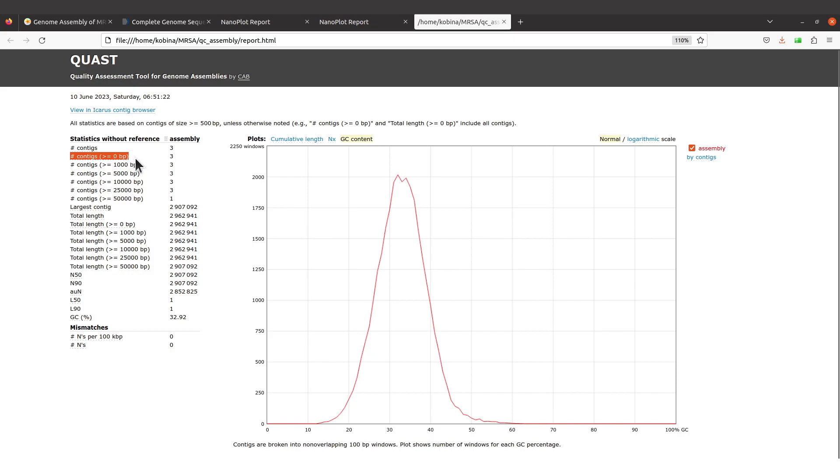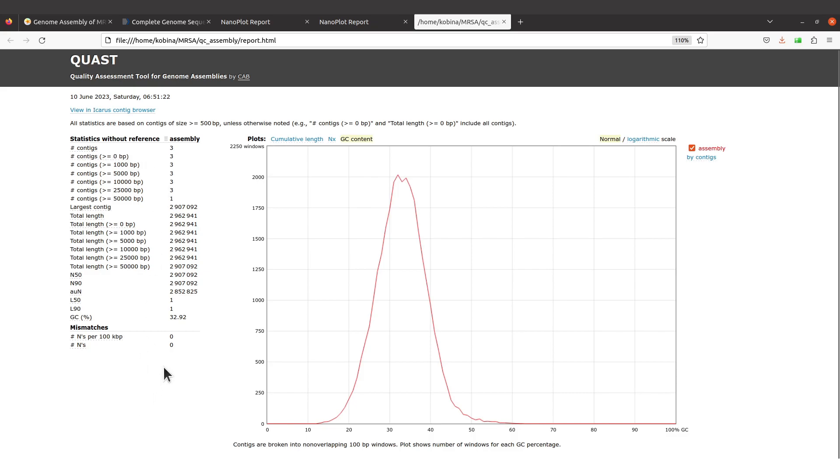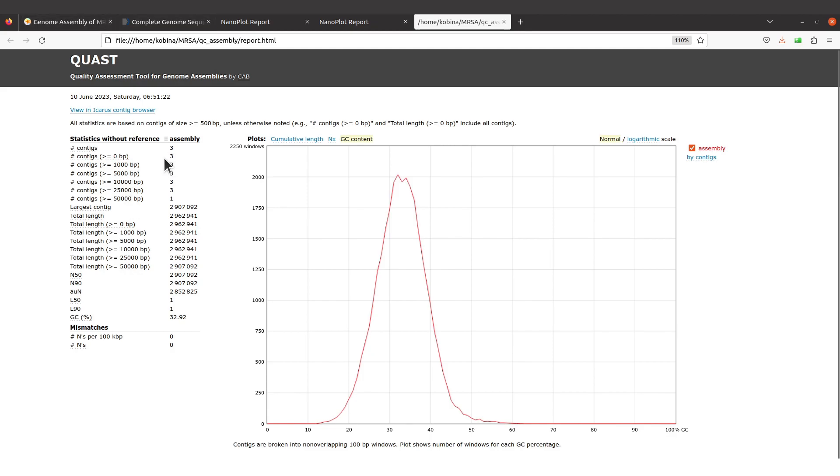I thought I'd bring this to your attention. For us we have three contigs and all of them have their sizes greater than or equal to 500 bp, so that's fine.